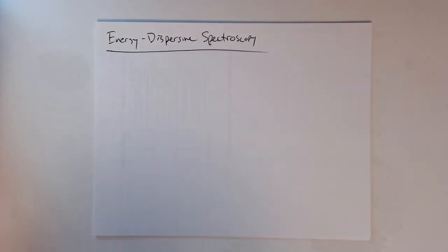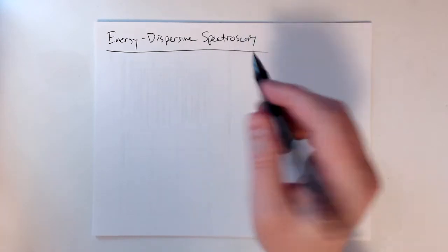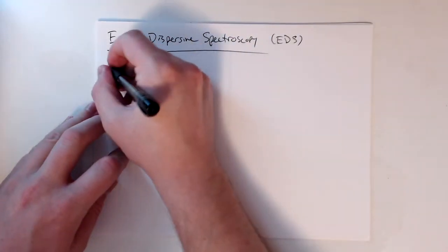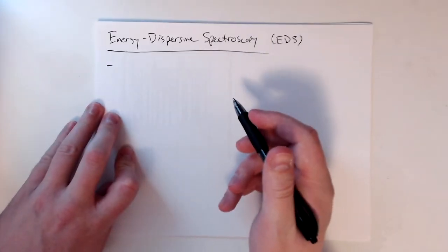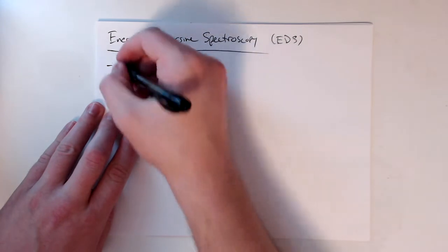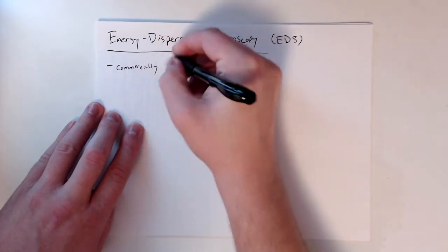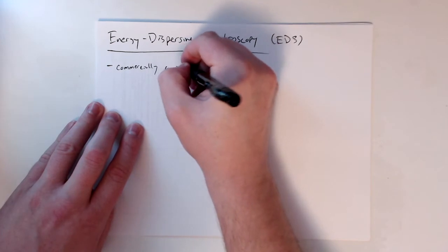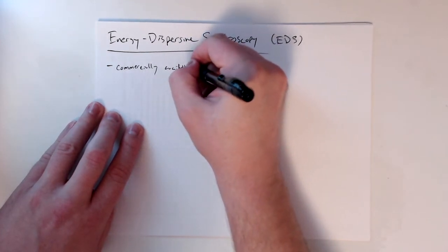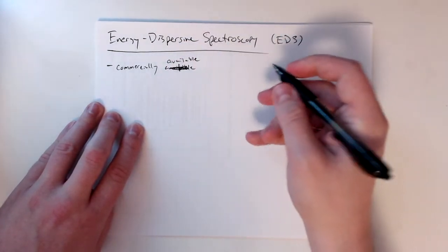All right, so let's take a more detailed look at energy-dispersive spectroscopy now, or EDS. So again, like I said, EDS is actually the second of the two chronologically, but it's been commercially available since the 70s, and I continue to have spelling struggles today.